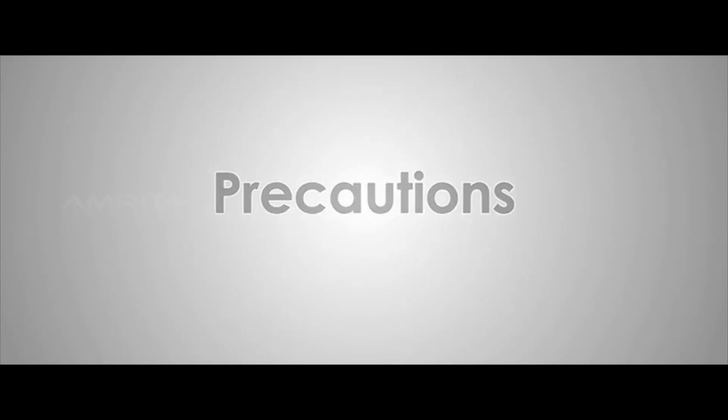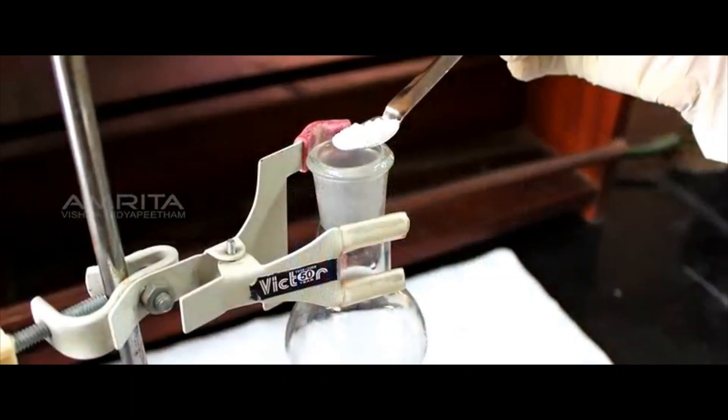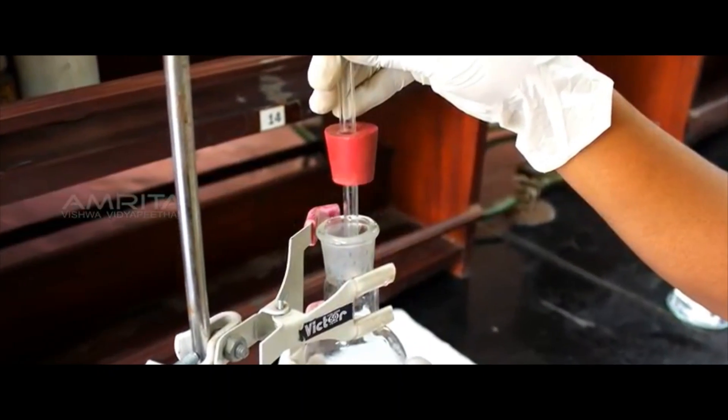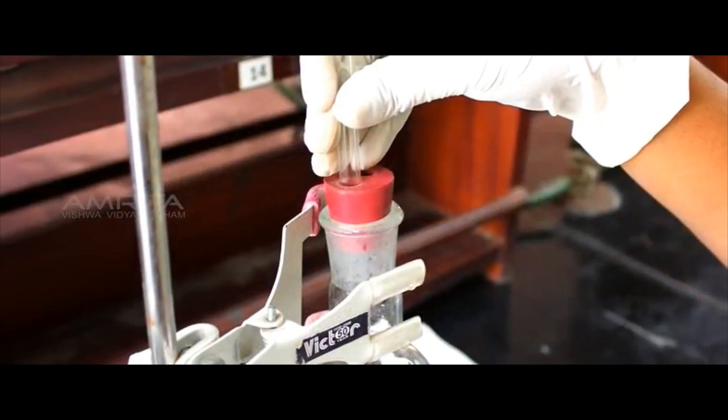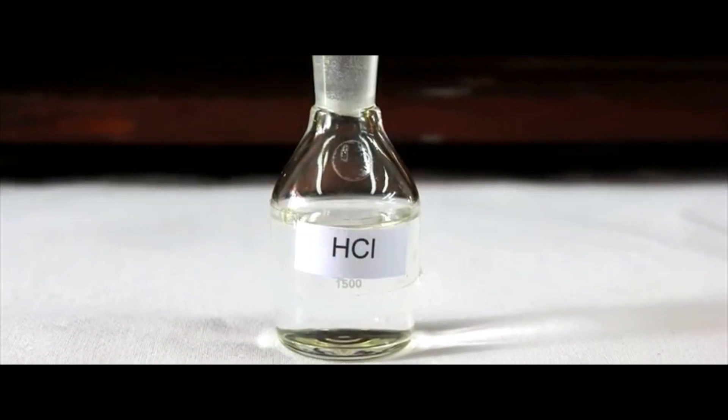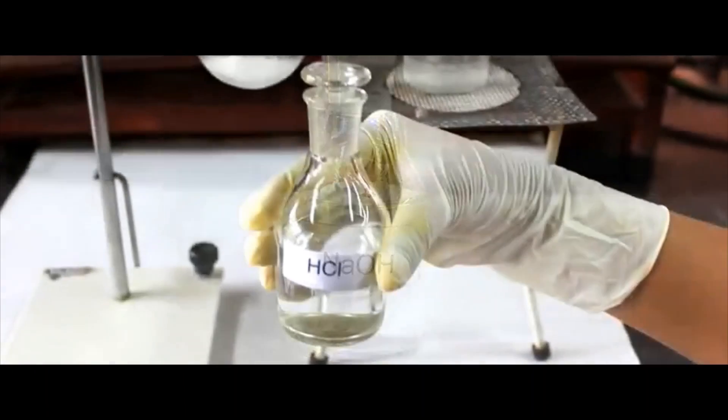Precautions: Add HCl to sodium carbonate only after making the apparatus air tight, otherwise the gas evolved in the reaction will escape through the gap. Handle the chemicals HCl and NaOH carefully as they are harmful.